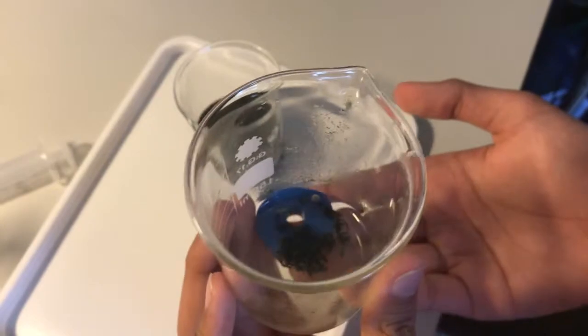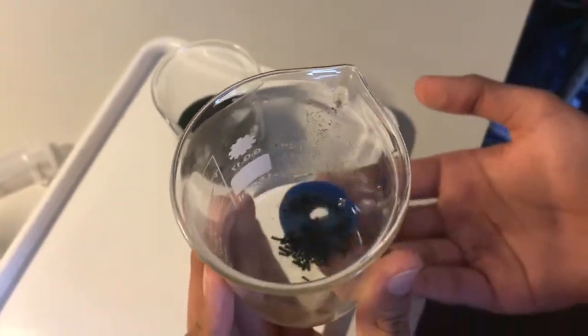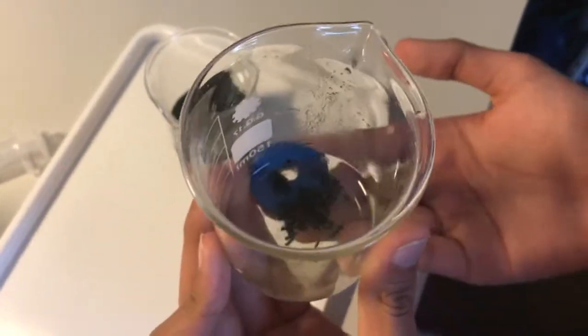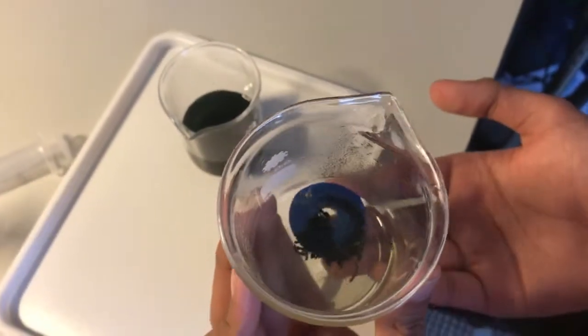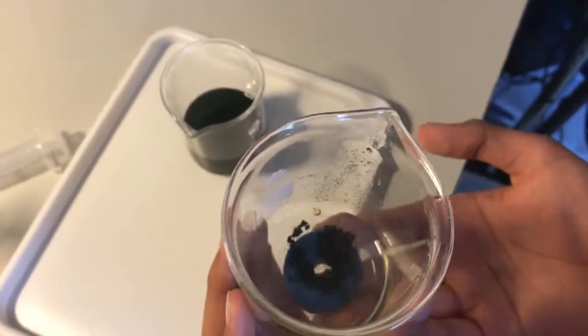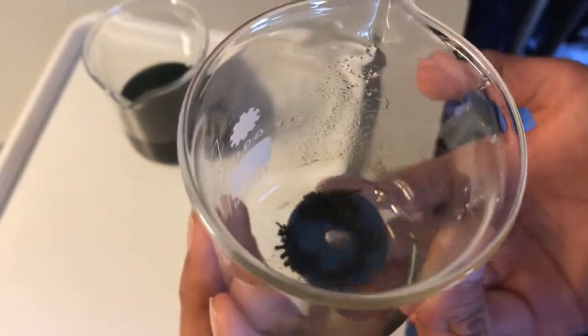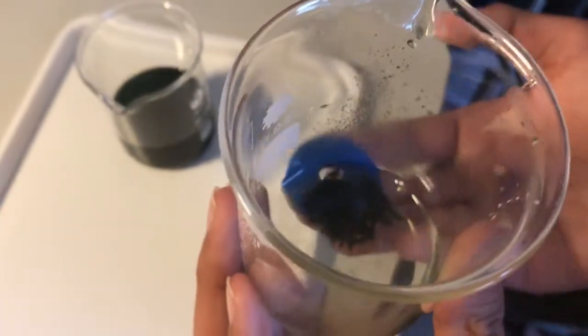You can see that the particles now respond to the magnet and that the new compound produced is indeed magnetic. The iron ions in the iron sulphate solution have turned into metallic iron on the surface of the magnesium particles, and you end up with magnesium shavings covered with a thin layer of iron. This metallic iron is magnetic and will stick to a magnet.